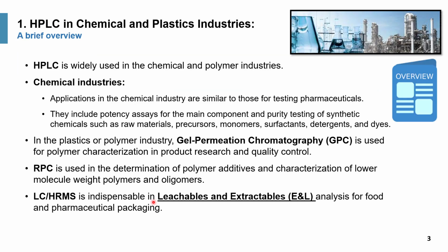Here's a brief overview of the chemical and the plastic industry where HPLC is widely used. I would comment on the fact that for the chemical industry, HPLC has some similarity with testing in pharmaceutical, including things such as the potency assay for the main components, purity testing for synthetic chemicals, and also testing of raw material, precursors, monomers, surfactants, detergents, and dyes.